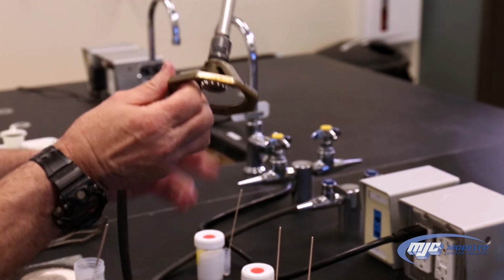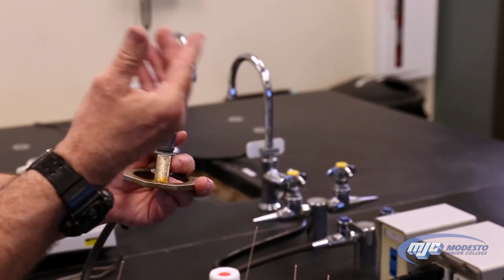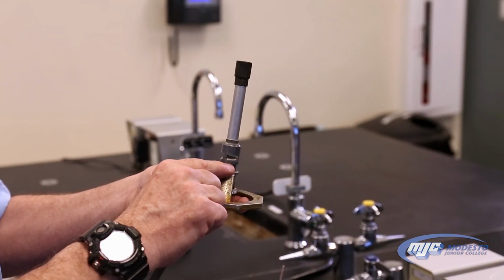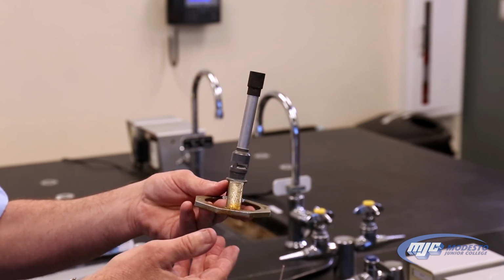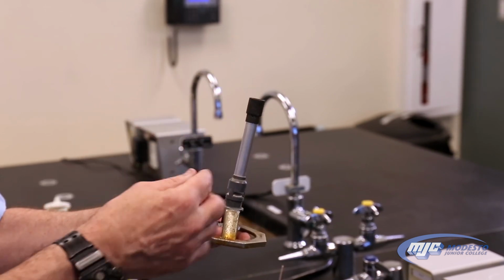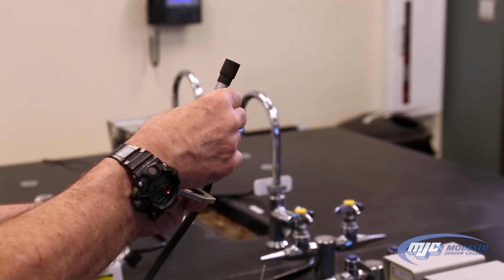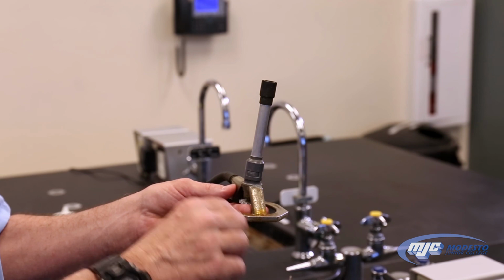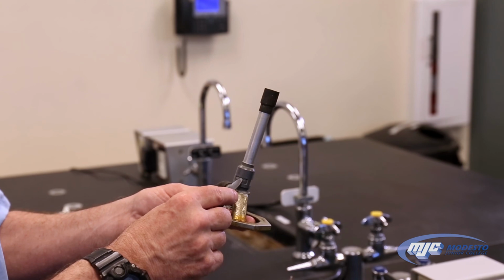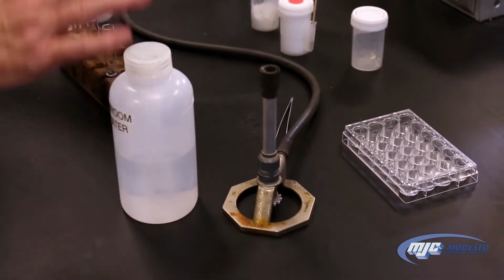That's our starting point. The third control on the Bunsen burner controls how much air, and that means how much oxygen, gets to the flame. That gap right there controls how much oxygen gets to the flame. The bigger it is, the more oxygen there is. Now, we don't want too much oxygen getting to the flame because it blows itself out. So we're going to start with that gap about 1 millimeter or so between the top of the threads and the top of the gap, right about there. And we'll adjust it from there. So we have everything adjusted to our starting point.